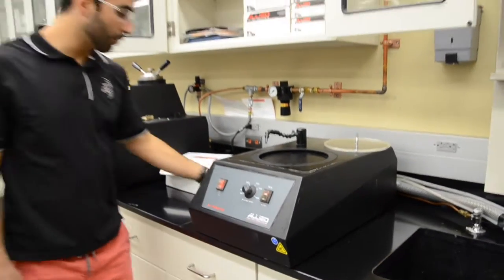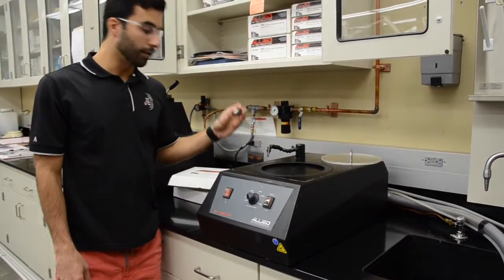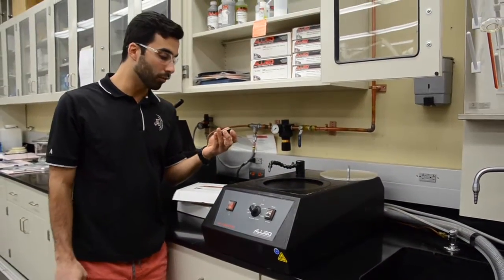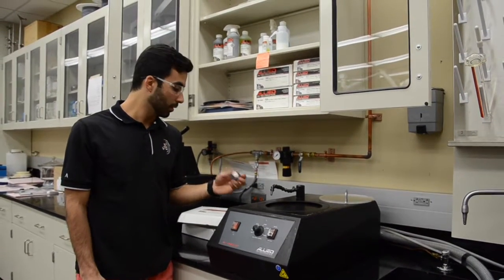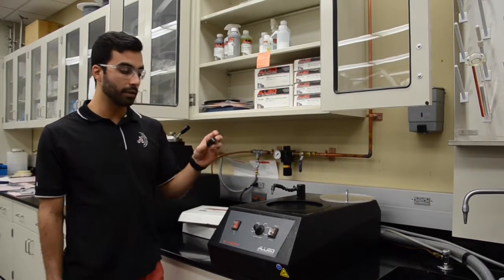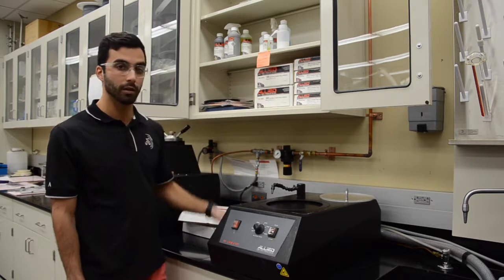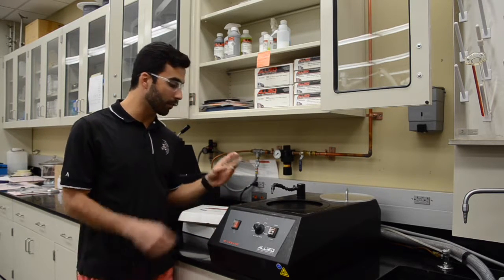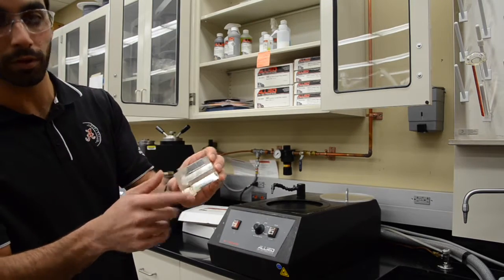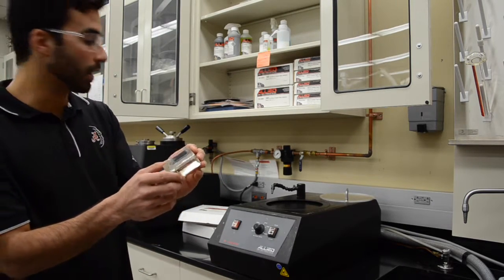For grinding, today we're going to be using a dummy sample to show you how to do the grinding steps. Since the finishing in the sample is not that bad, we can start with a 320. If you have a sample that has a really bad surface finish like this one, you may want to start with a 180.